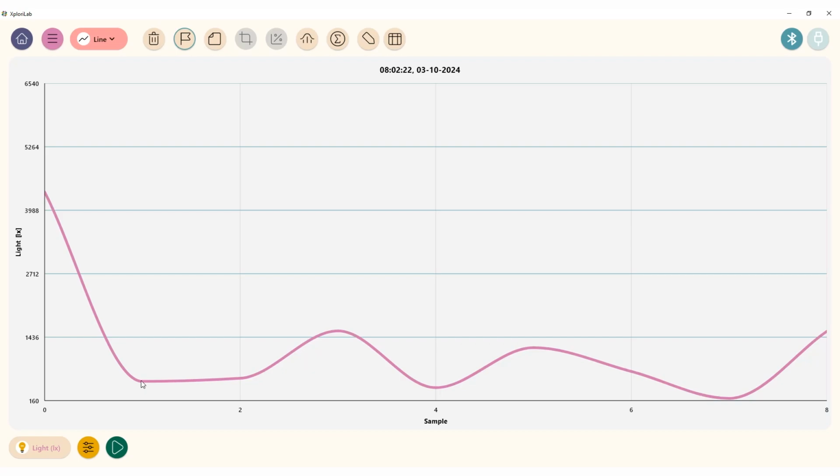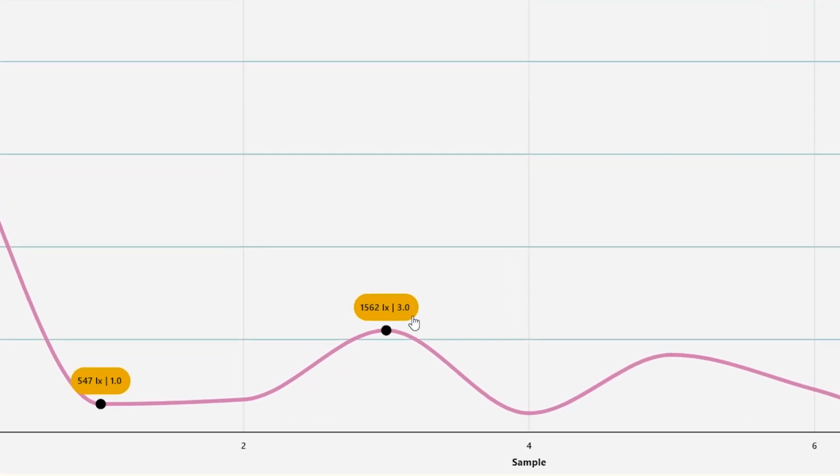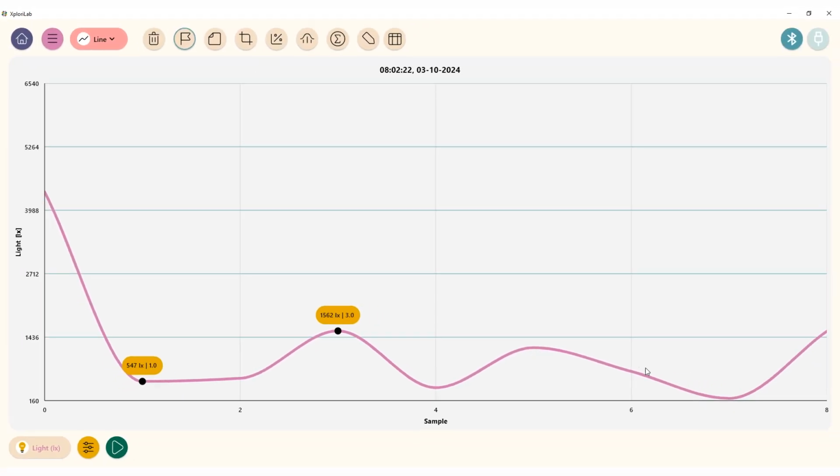When you do so, you can now select multiple data points on your graph and get the collected data as well as either the timestamp or sample number for that piece of data. Now, if you would like to add more than 2, you'll notice clicking doesn't work. However, you can still add more than 2 markers, but you can only have 2 movable markers, indicated by this black dot on the bottom. Clicking on that black dot will allow you to move it between your data points.